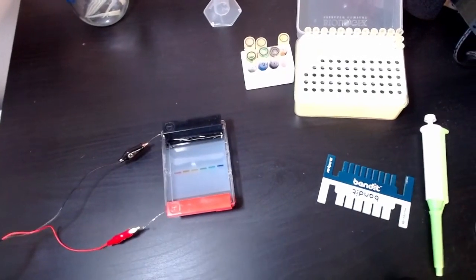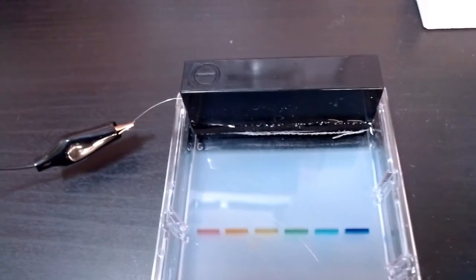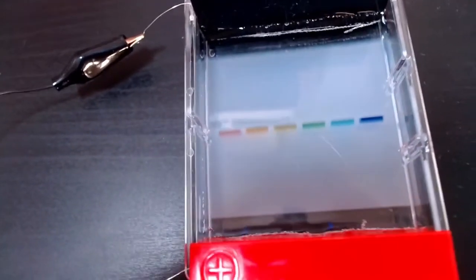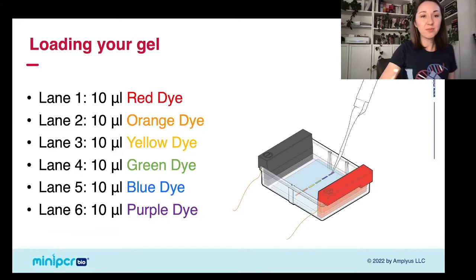So I'm going to take my webcam and bring you in a little bit closer here. You can see that there are bubbles starting to form at that back wire on the gel at that negative electrode. And so now we're going to see what happens to our dyes. So we're going to leave those to keep running. We're going to come back to our presentation. All right, so those are going to run for about 10 or 15 minutes. We'll check back in on them in a moment.